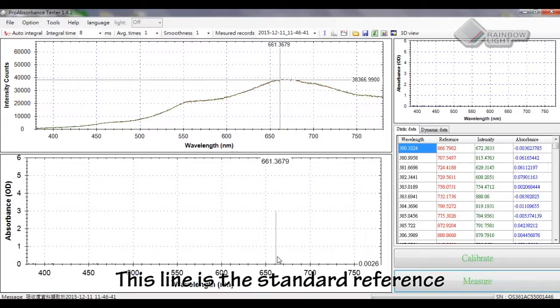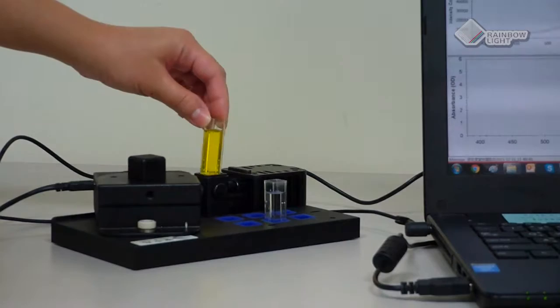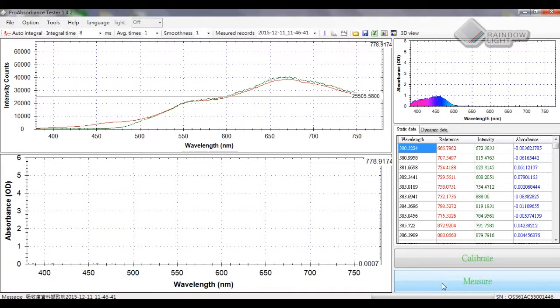After clicking calibrate, we will see this line is the standard reference. Now we can put the other sample, which is ink, in that tube rack and click the measure button.